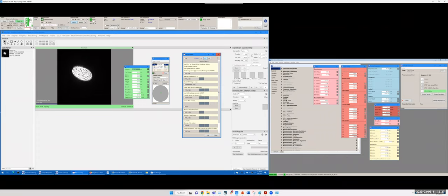Mm-hmm. Okay, so our idea of doing this procedure is to make sure this aperture is not moving up and down. So I will say, okay, let me give it a try. You need to be very careful about the strength because this value is very sensitive. If I click the up arrow, change the magnitude to 1 milliamp, and tap the left arrow by one click, the beam is gone, okay? A disaster, so we don't want to do that. But the good thing is if you change it very badly, you click ESC on the keyboard, it won't store the change. So I didn't change anything, I just click ESC, it's back, okay, that's good.